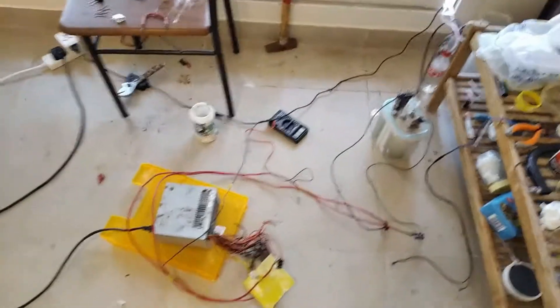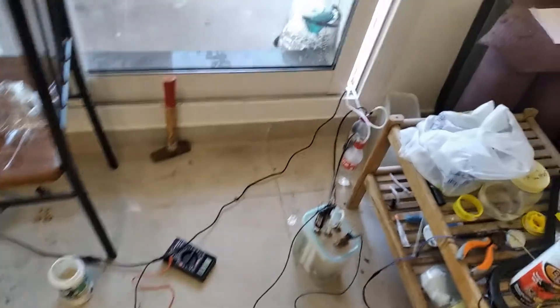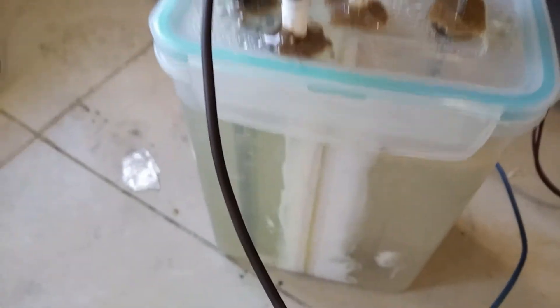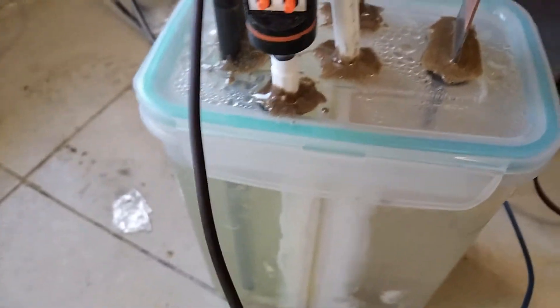You see, over here we have our very, very amazing HCL generator. So right over here, this is our chloroalkali cell using a sodium borate and a PVA glue-based membrane.